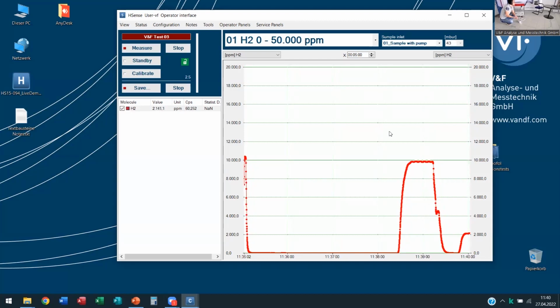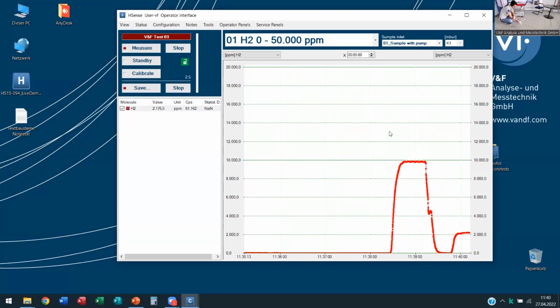And this is pretty much what we see here. Of course, I don't know the concentration currently myself because I don't know the 2 flows, but it's just to give you an impression of how the instrument reacts. So next step, I can open the hydrogen side a little bit more, maybe close the nitrogen side a little bit, which should lead to an increase in the signal. Maybe even a little bit more.